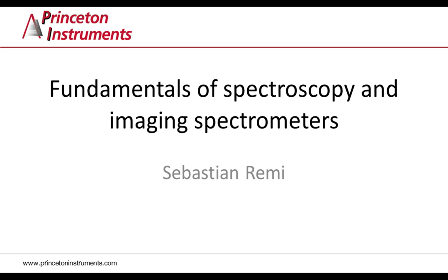In the second part of the webinar, I will talk specifically about imaging spectrographs, as they are widely used in doing spectroscopy, and discuss some cases we practically discover often in the field, mainly how to get light into a spectrograph and what effect aberrations in the instrument's response have on experiments and observations.